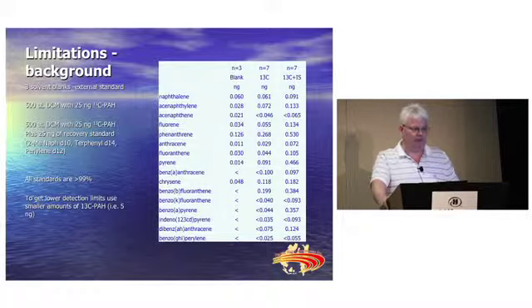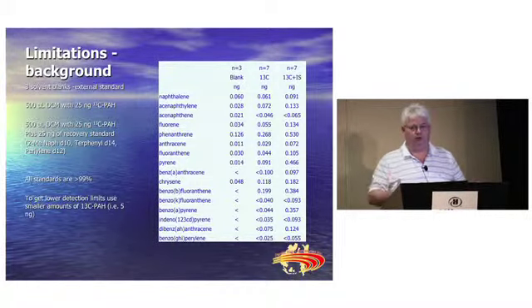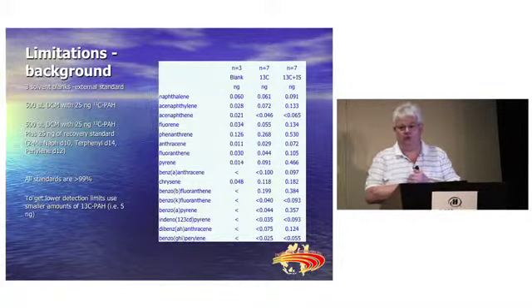Partially, it could be coming from the C13 standard. And lastly, we had a commercial mix for our internal standard or our recovery standard that we added as well, which also was contributing to the PAH. So one of the limitations of going to lower levels is not only within your lab, but in what you're getting. Now, the standards themselves are guaranteed only to 99%, and indeed, we found they all exceeded that standard.